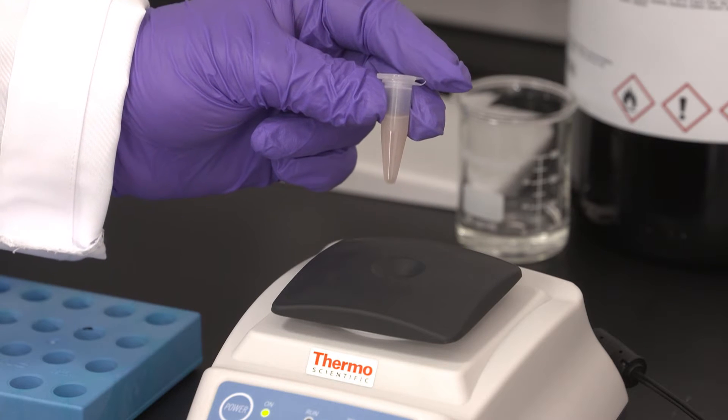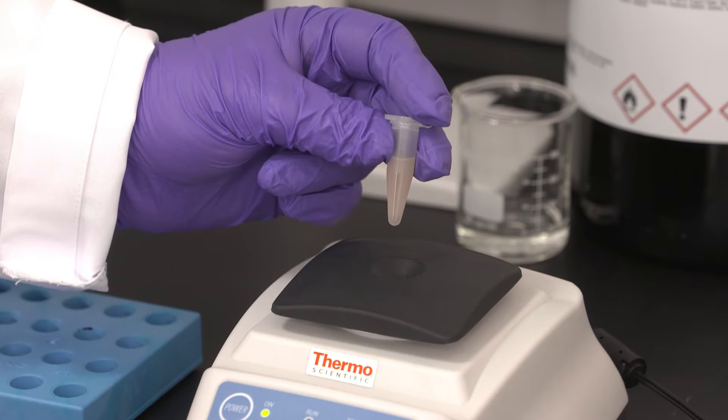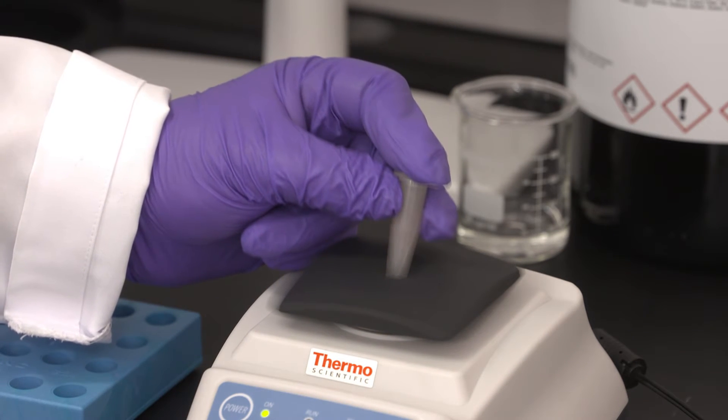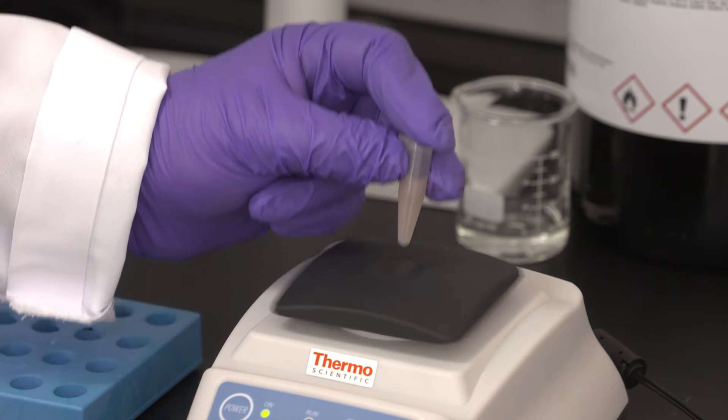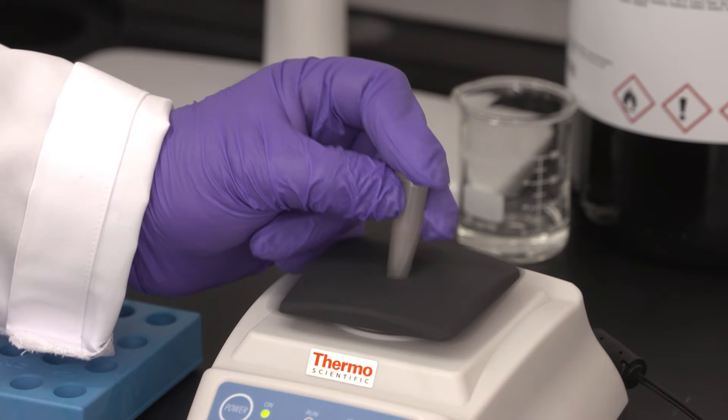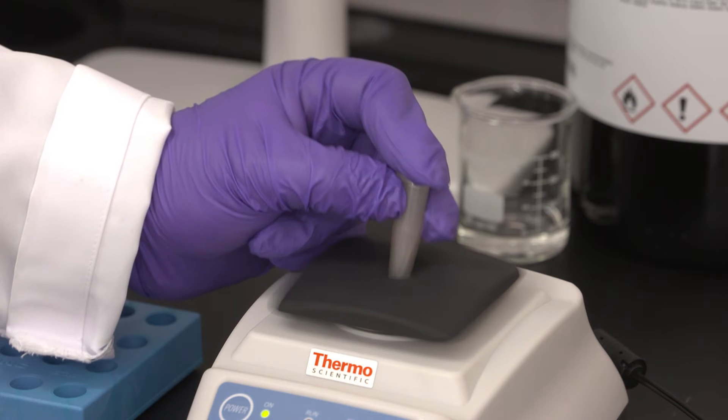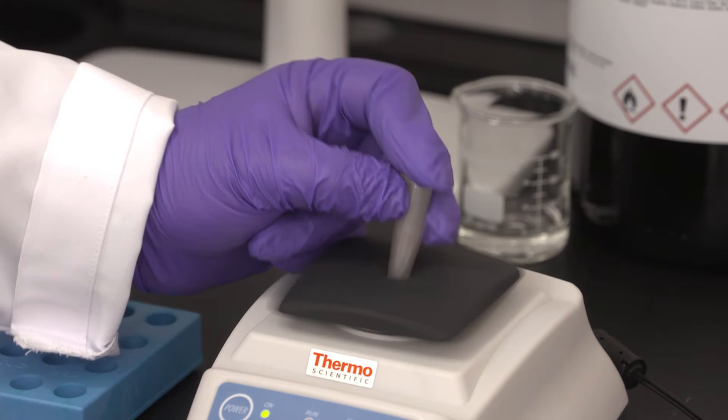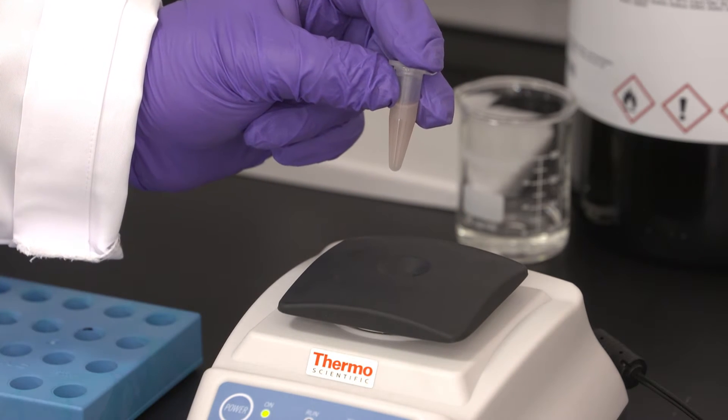The next step will be to vortex the mixture to ensure the sample is completely homogenous. We can vortex the sample for 15 to 30 seconds, or you can use a multi-vortex where you can put multiple samples and vortex for no more than 30 seconds.